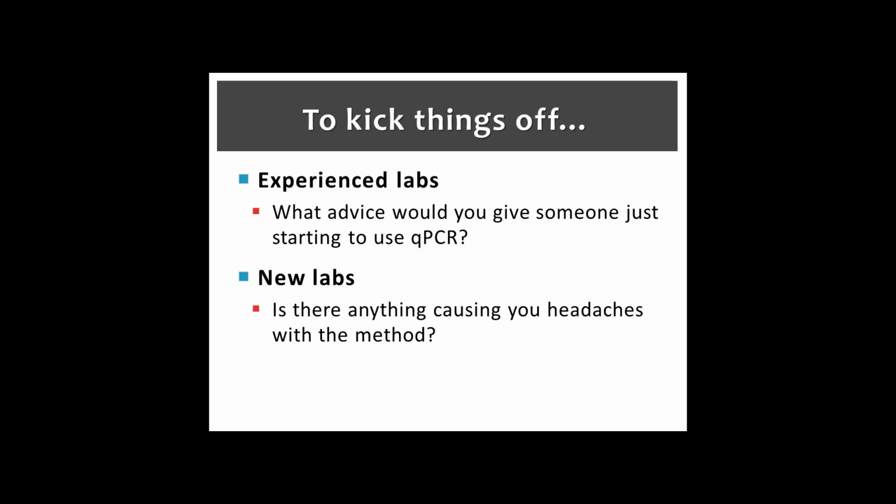Sorry, I'm a little unclear on how you elucidate the source tracking: comparing your beach water to a possible source, or subtyping the DNA in some way, or getting specific elements in the DNA which are traced back to the species? Typically, from a molecular qPCR standpoint, what you're doing is targeting a DNA fragment from an organism that's been associated with a specific host animal. Obviously, human is a biggie there. So assays have been developed that target a gene that's only found in bacteria that are, well, I shouldn't say always, but for the most part at least 90 percent associated just with humans. Does that answer your question?